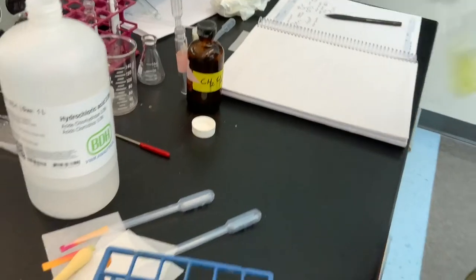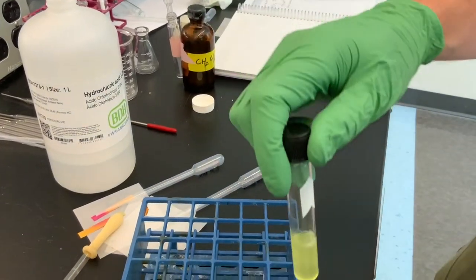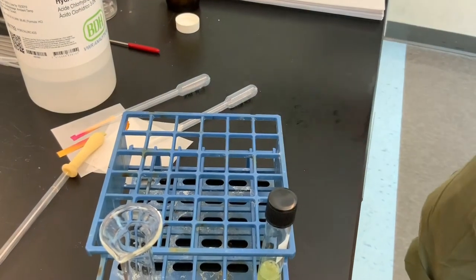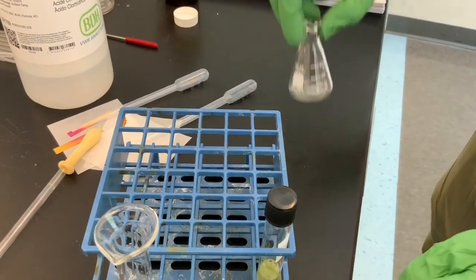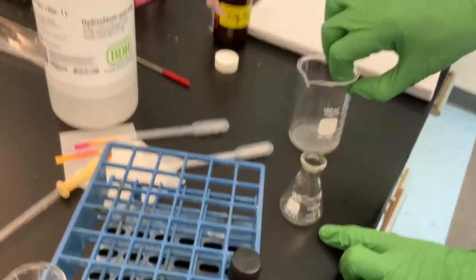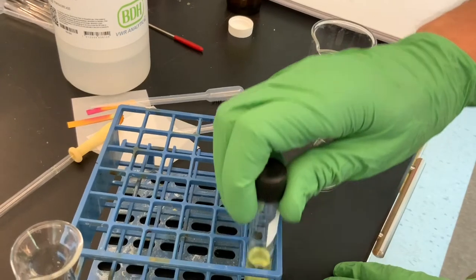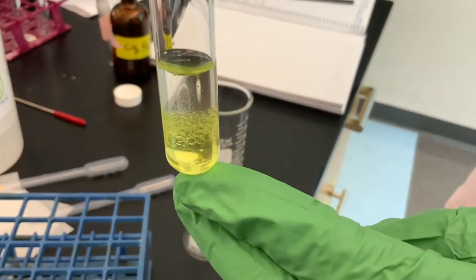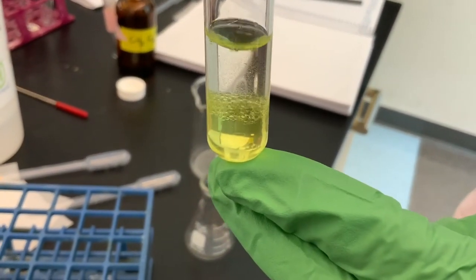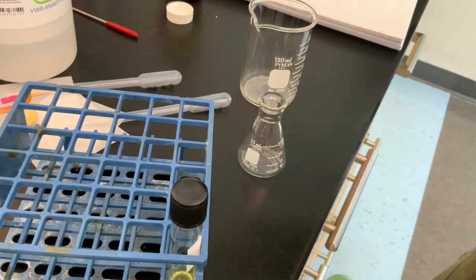And now what we're going to do similarly is separate the two layers, our two phases, and the procedure here says to use a 25 milliliter Erlenmeyer flask, and we're also going to nestle this in an ice bath. Since my most recent shake, the two layers are still separating, so I'm just going to go grab some ice while that happens.